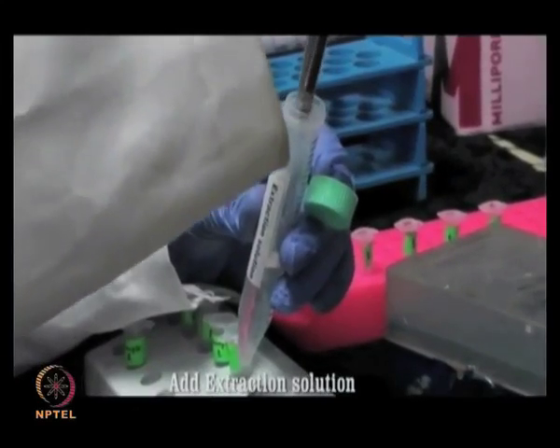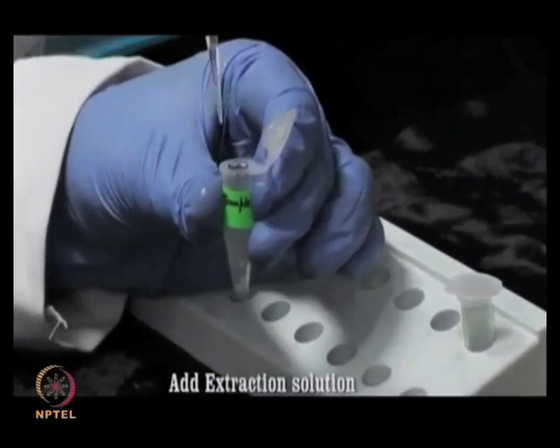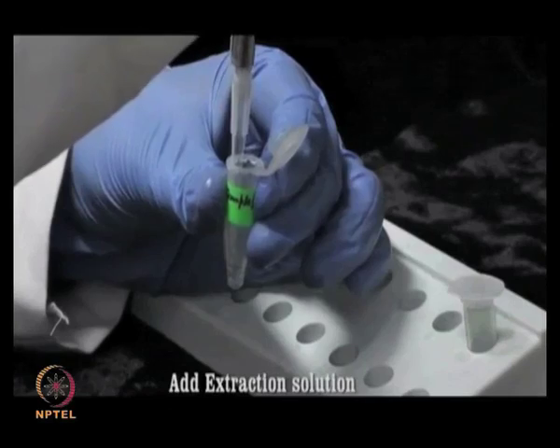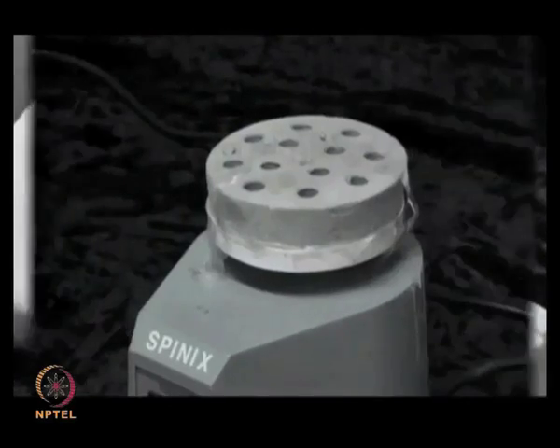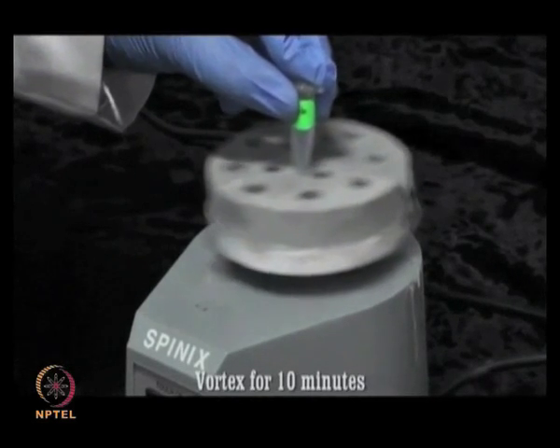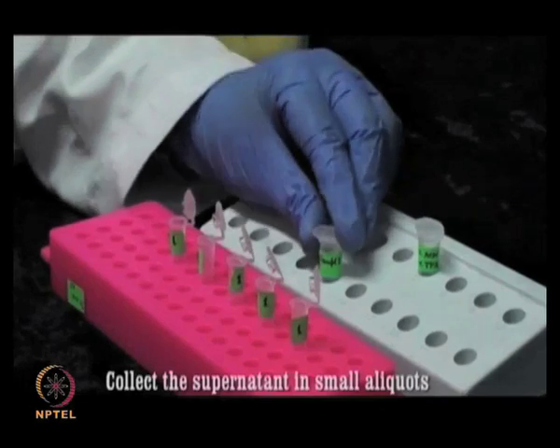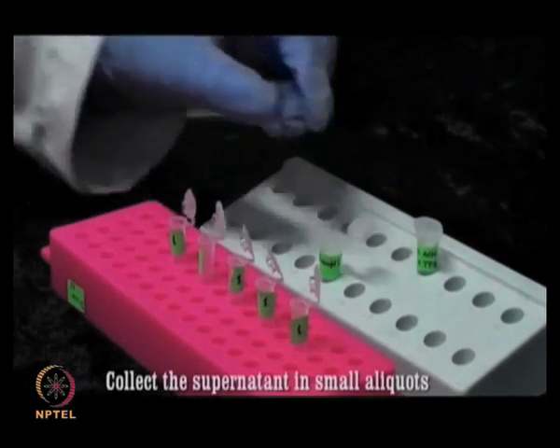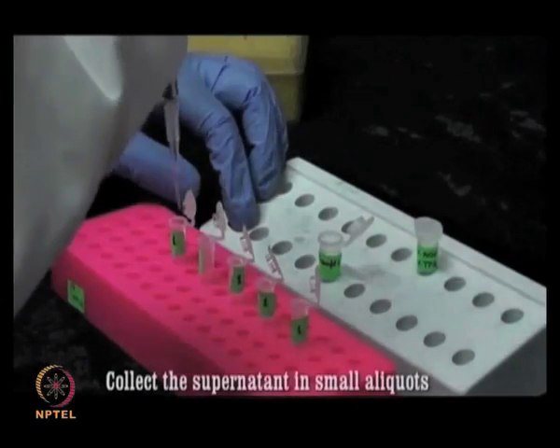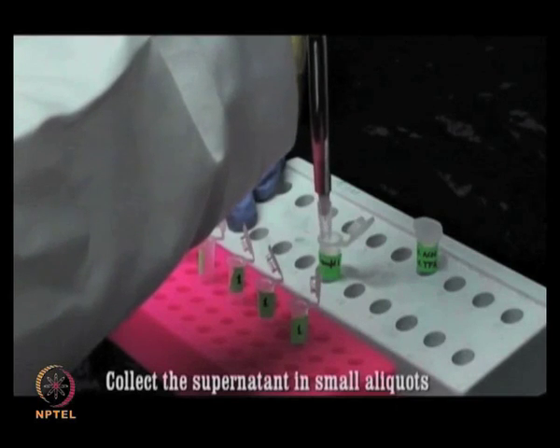Now, after the overnight incubation, the peptides generated through the proteolytic digestion can be extracted by using extraction buffer containing 0.1% formic acid or trifluoroacetic acid in 50% acetonitrile solution. Now, collect the supernatant in small aliquots, and extracted samples can be stored in these small aliquots.